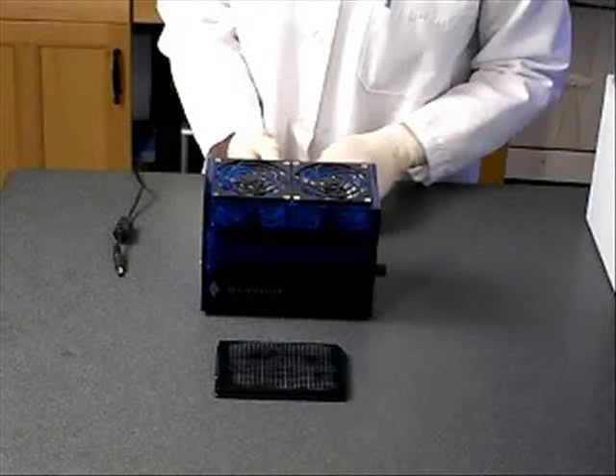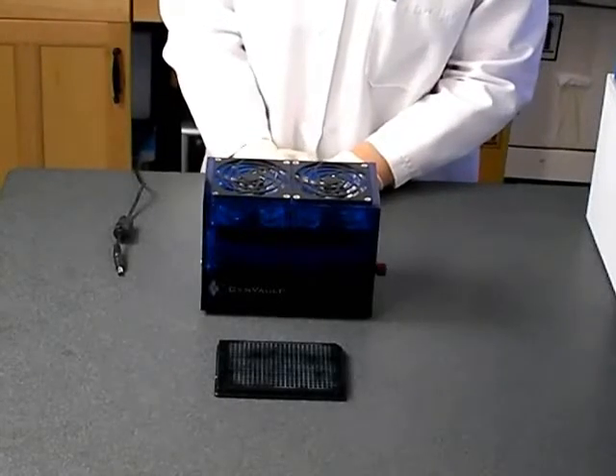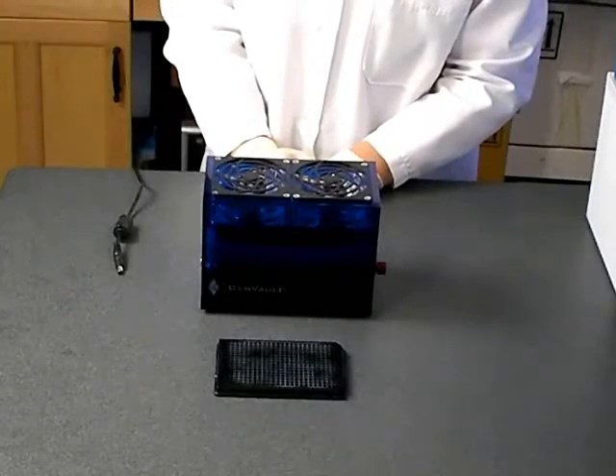It is also possible to dry the GenPlate using a fast dryer. Because the GenPlate is spotted with a sample type that is potentially hazardous, GenVault recommends that you place the fast dryer in a biosafety hood for the drying step. As the sample is dried onto the paper, the cells are lysed upon contact, inactivating viruses and bacteria. After the sample is dried onto the GenPlate, it is considered non-biohazardous.